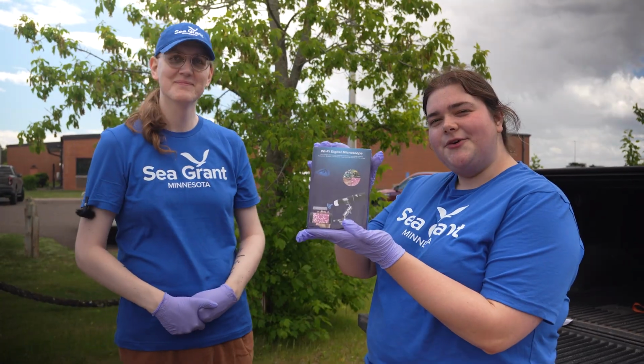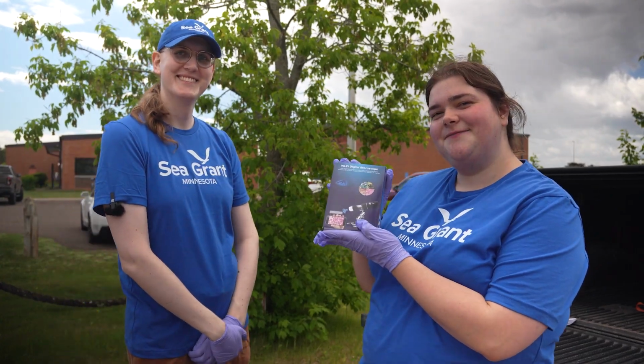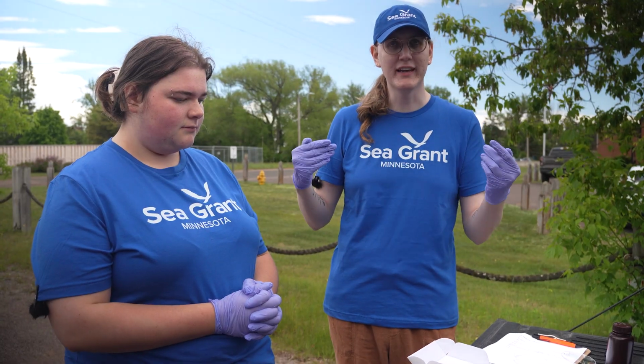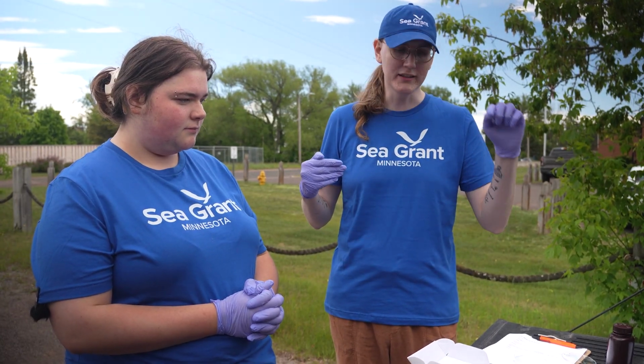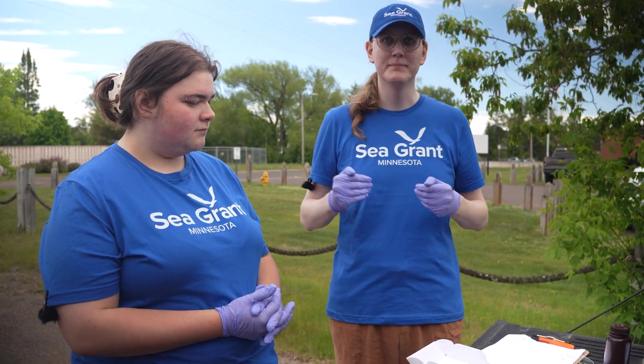I'm Kimberly. I'm Allie, and we are both interns working on the mn-lake-lookout project. We're going to show you how to use the digital microscope with your phone or other digital device. Before you head out in the field, we recommend downloading the MaxSee app, M-A-X-S-E-E, from the Google Play Store or the Apple App Store.